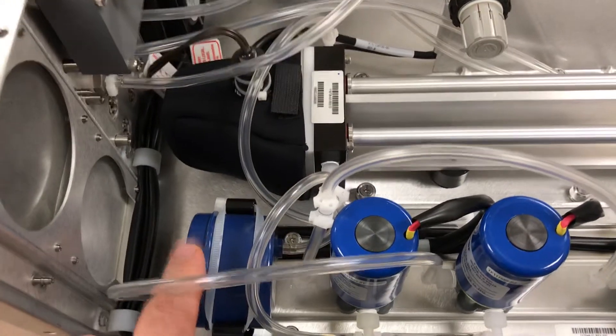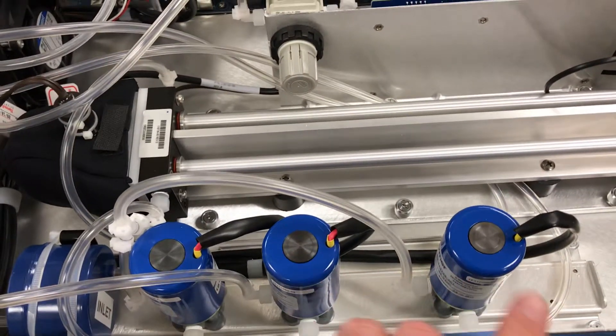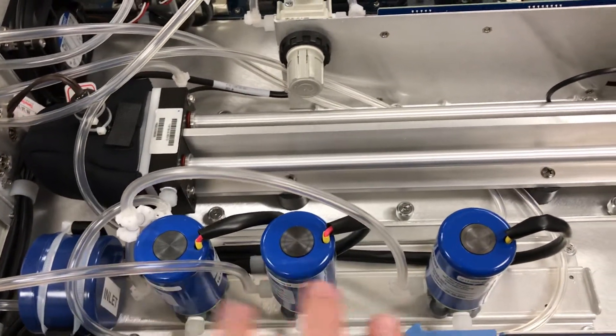Coming around the side, there's still the ozone scrubber, now mounted towards the back of the instrument. Then you have the switching solenoids for the reference-sample switching modes that occur on this ozone instrument — three solenoids here.